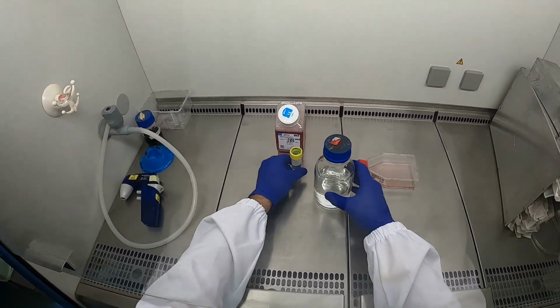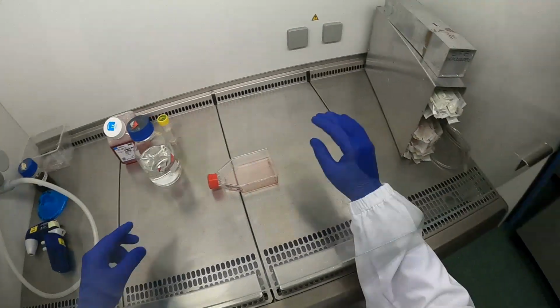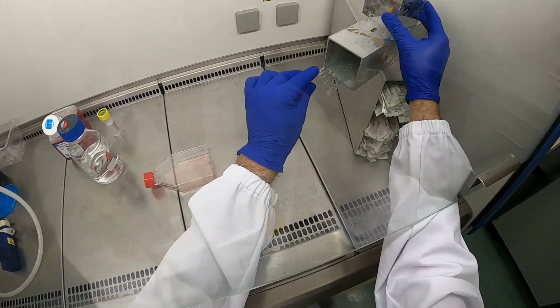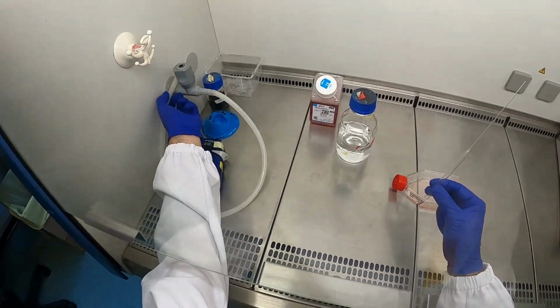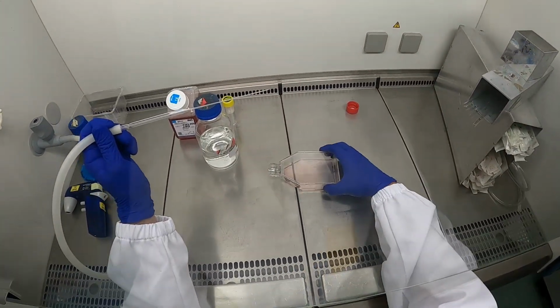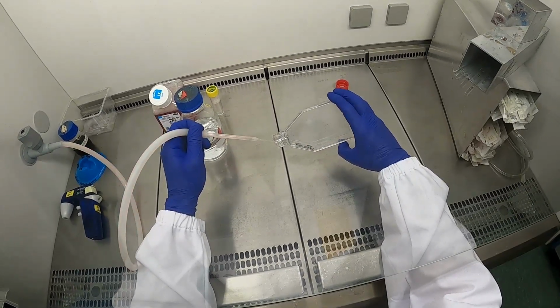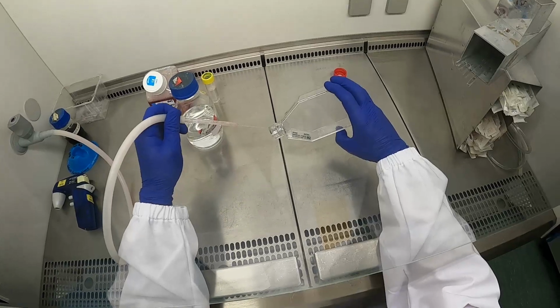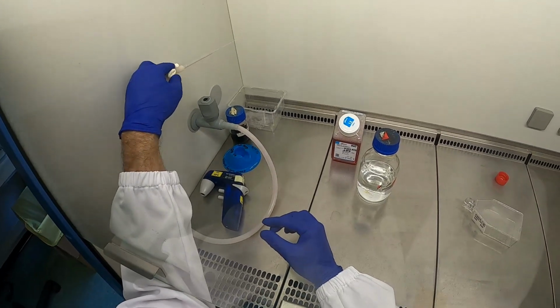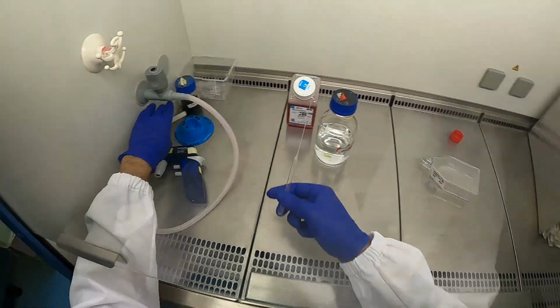Okay, so let's start by washing the cells with the PBS. So we first take a Pasteur pipette, a glass pipette, sterile. Everything is sterile which is in the hood, because we don't want to introduce bacteria or yeast or anything. We carefully take off the cap. We've attached the Pasteur to the silicone tube, which is connected to a vessel that is put under vacuum. So we're sucking out the medium that was on top of the cells. Normally I'm trying to reuse the Pasteur, but if it doesn't want to stay there, I just throw it away.